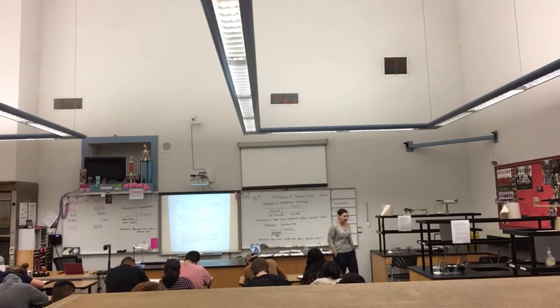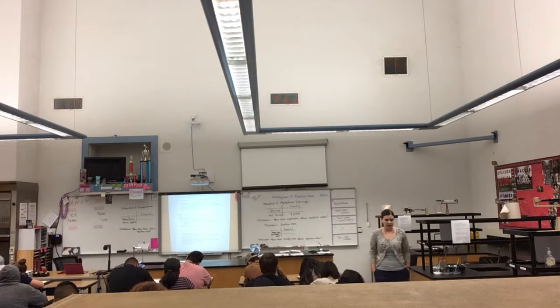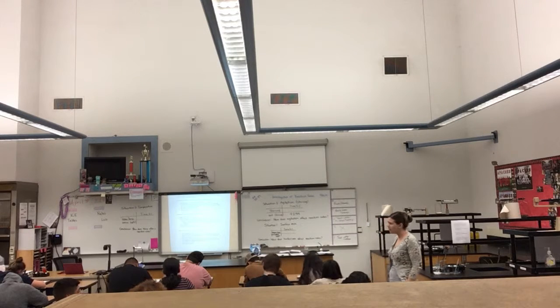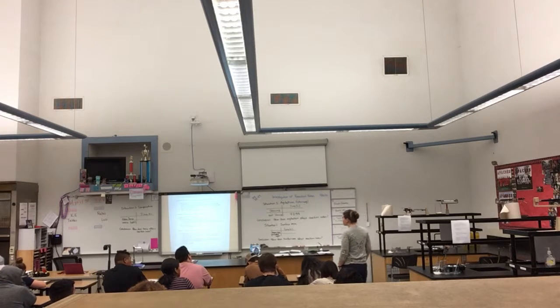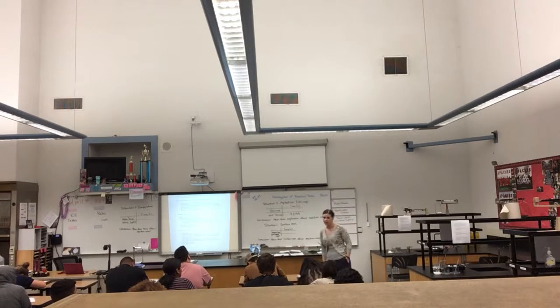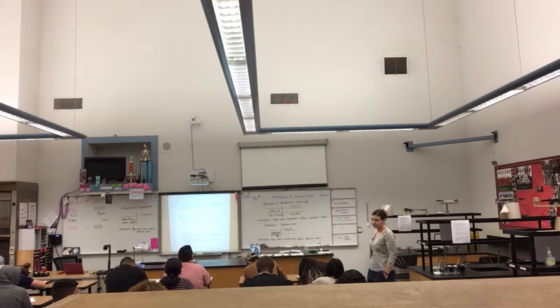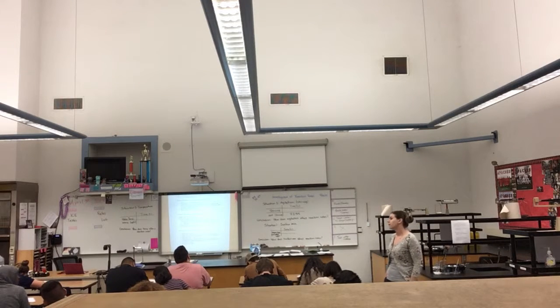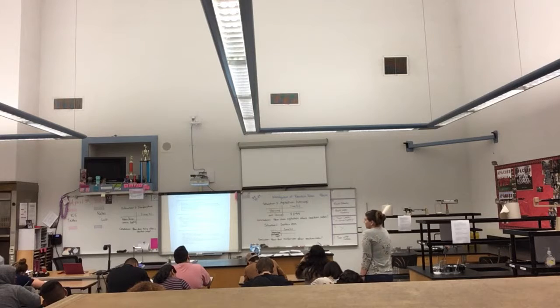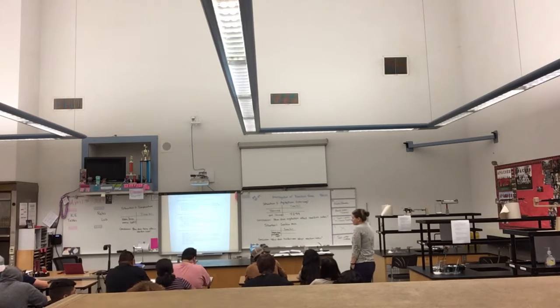Now, I am going to caution you because yesterday my class did not pay attention to their surroundings very well. I had 4 pieces of glass broken. I had 2 beakers, a thermometer, and a stirring rod broken yesterday in one class of 26 students. So please, please, please pay attention to your surroundings. I'm out of thermometers. If you break your thermometer, that's it. You're going to have to eyeball your 60 degrees Celsius or borrow a thermometer from someone else.